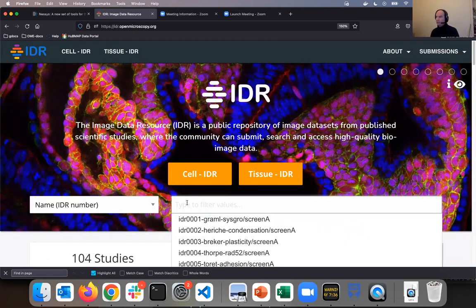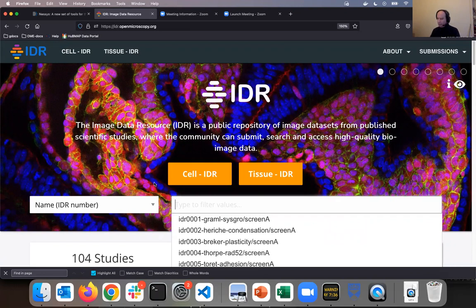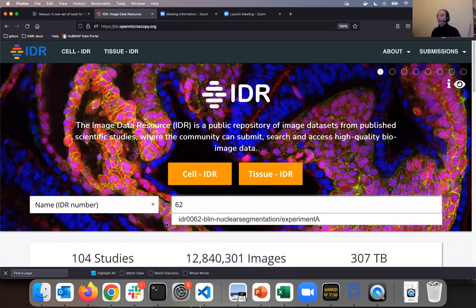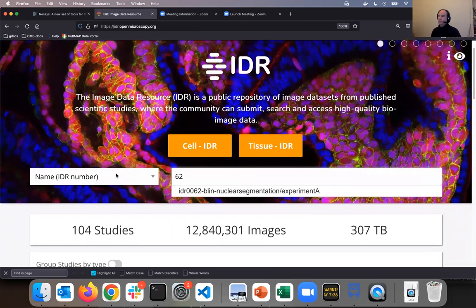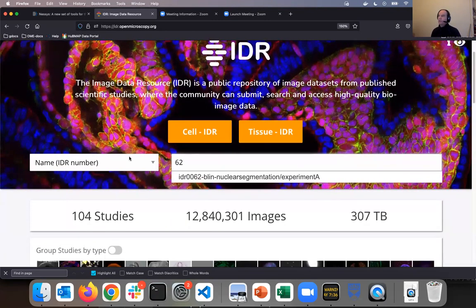And because I remember the number 62, I can type it here in the search and accept the default suggestion. But first of all, let me tell you, this is not the only way how you can approach your searches from here.